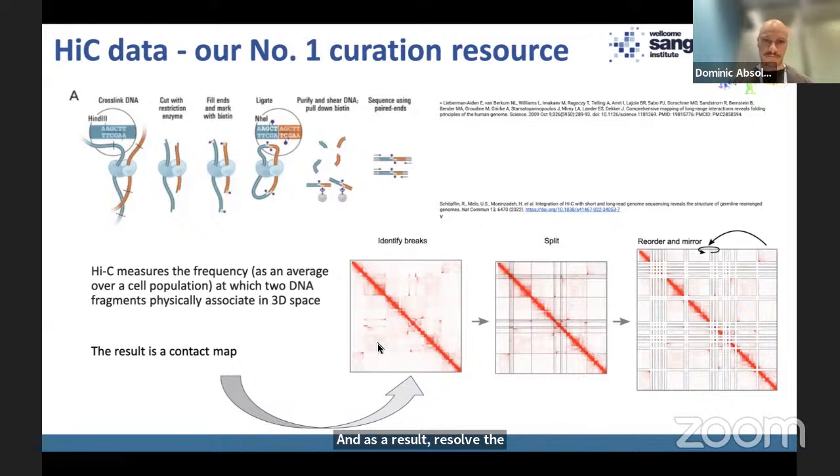So you can imagine that this frequency data of one-to-one matching between chunks of DNA can, scaled up, result in a heat map when they're plotted against each other. And that's why we have, down the diagonal, a really high intensity of signal. And then on the off diagonal, we have varying levels of the signal. And this is indicating that, by the way, can people see my mouse? Yes, cool.